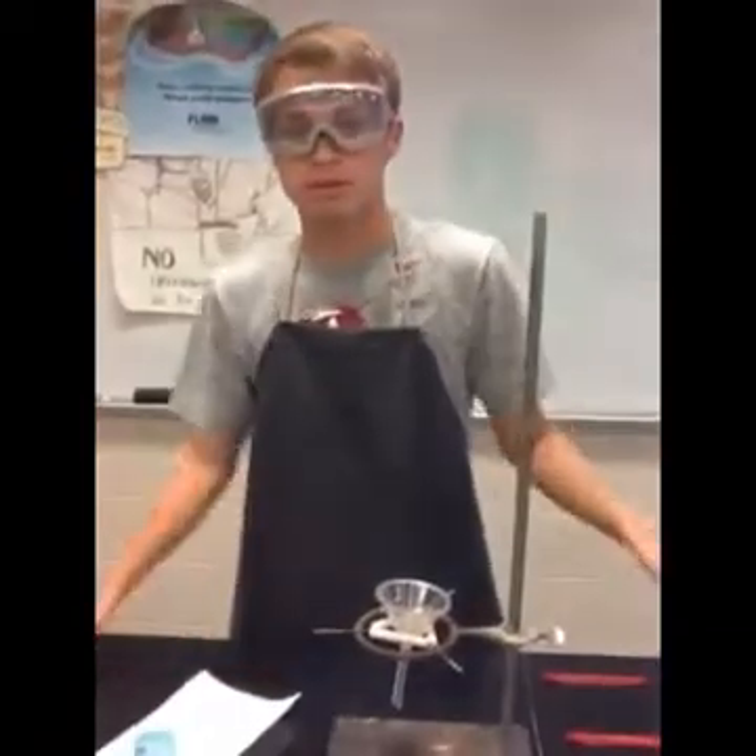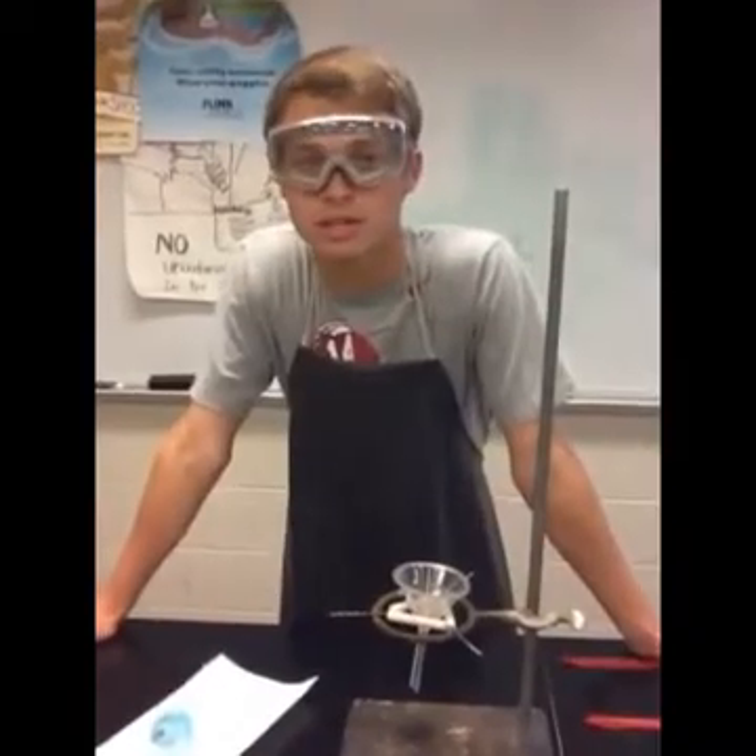And then just remember to clean up your supplies, so you stay classy, Mr. Elegante's class.